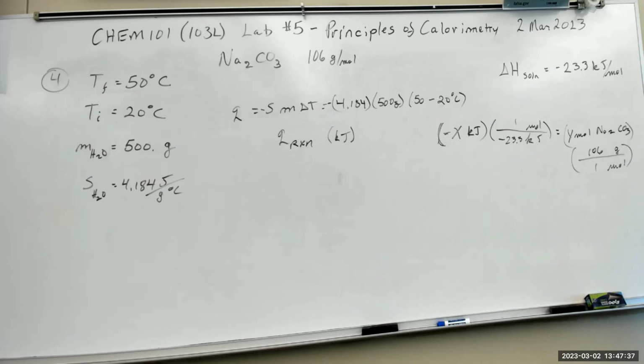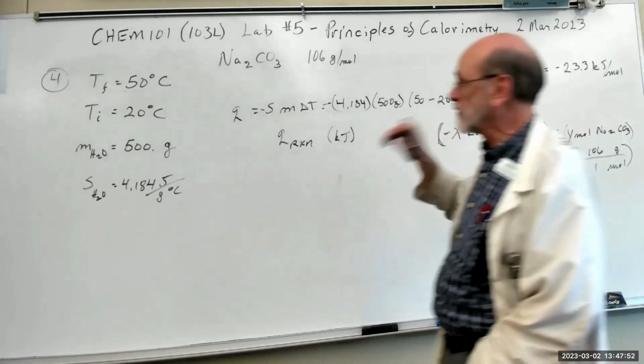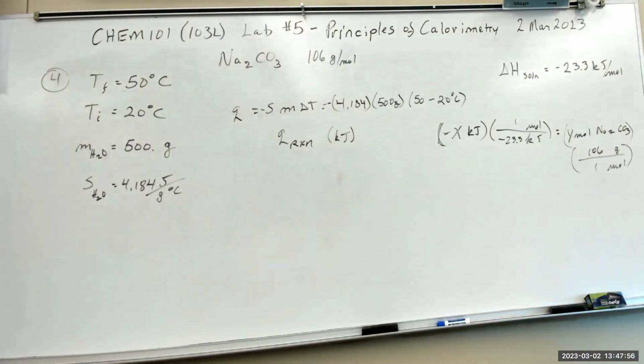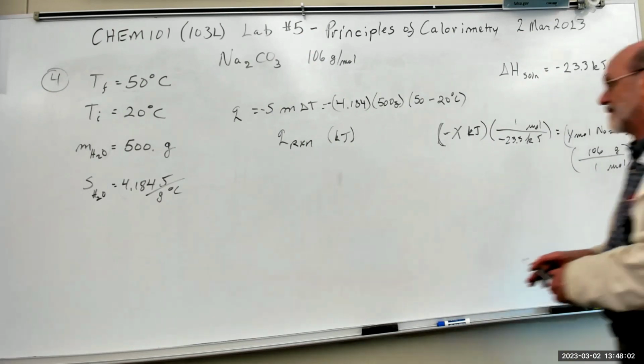And you do a similar type of thing for sodium bicarbonate. You'll have different values. It wants you to go from 20 degrees down to 1 degree.